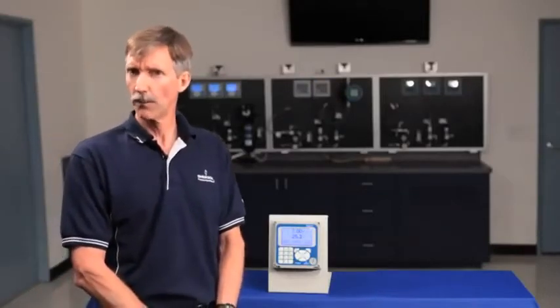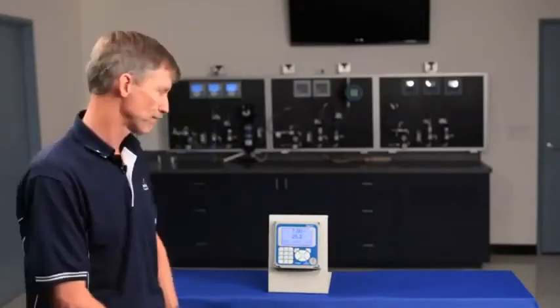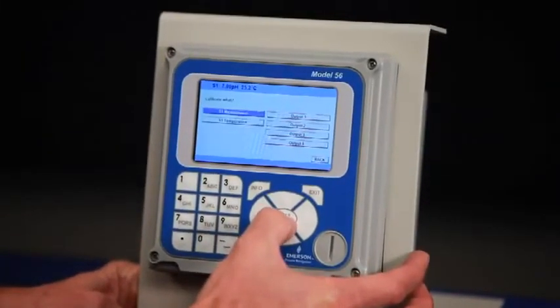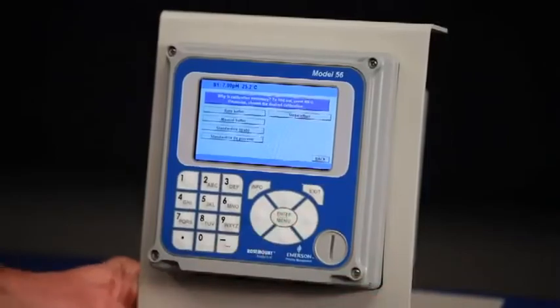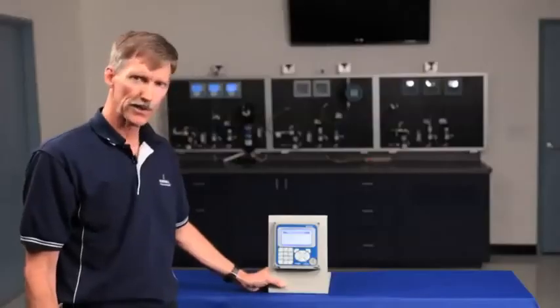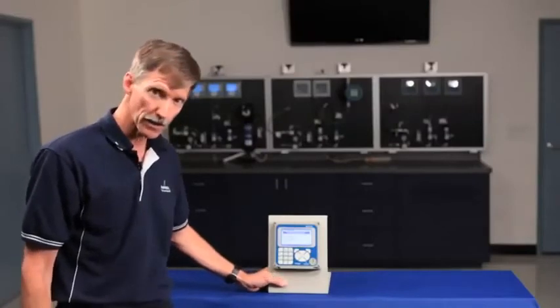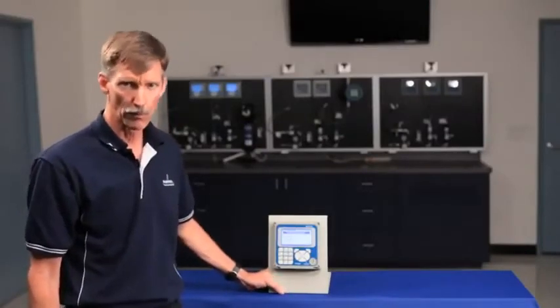So let's walk through a pH calibration as an example. Pressing enter gets into the menu system and you can see that a wide variety of different calibration methods are available with the Model 56, including automated calibration and several single point methods of calibration.